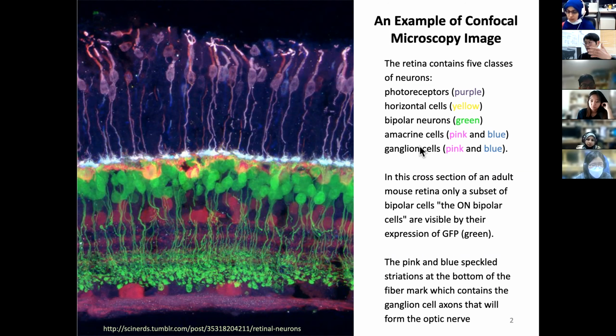So this cross-sectional image, I'm not teaching you ophthalmology, but the point is you can distinguish different cells in detail, their shapes. While this is a collapsed image, the original confocal is in fact three-dimensional imaging. So this gorgeous and very detailed subcellular resolution is possible by confocal.